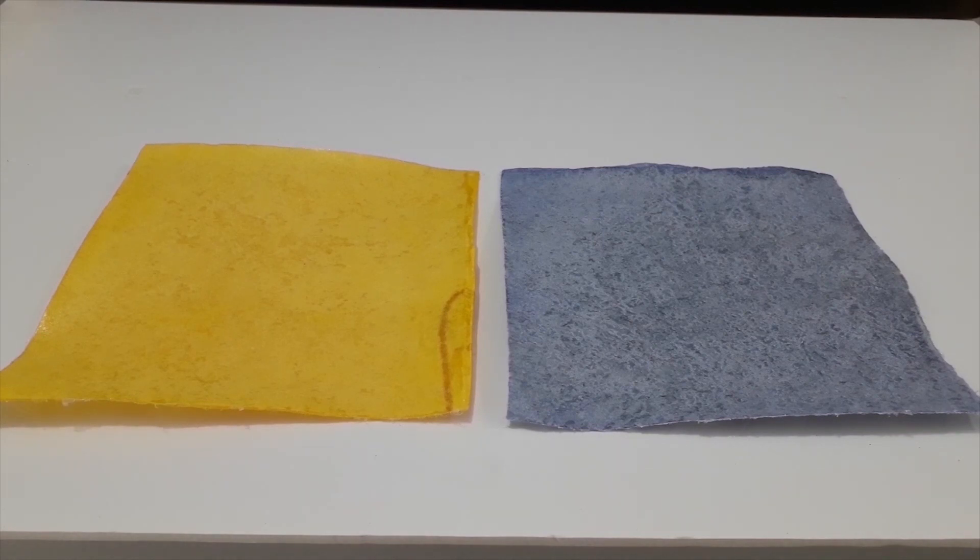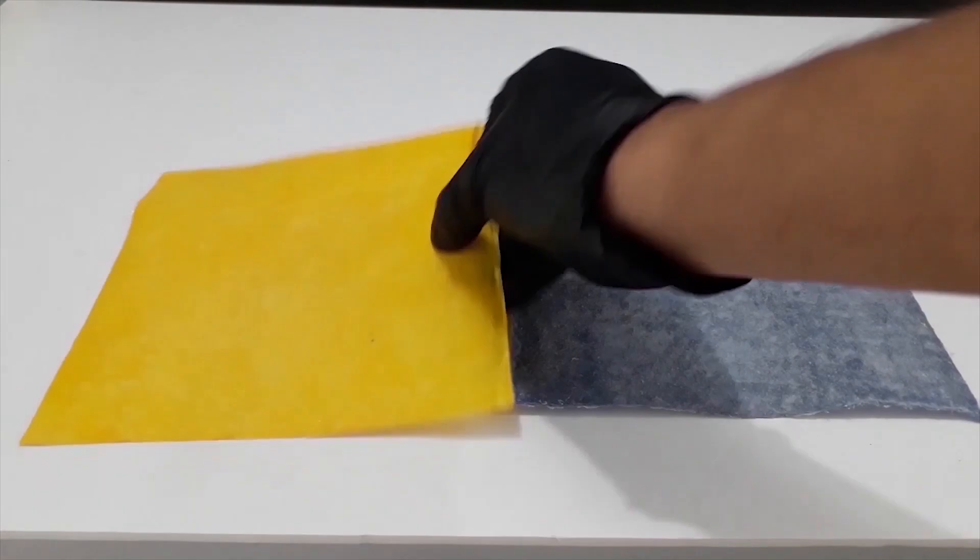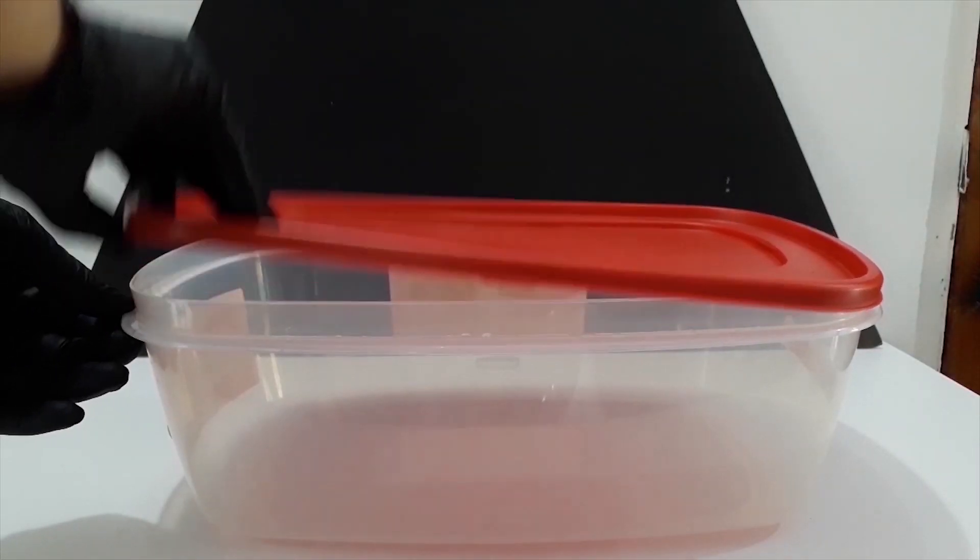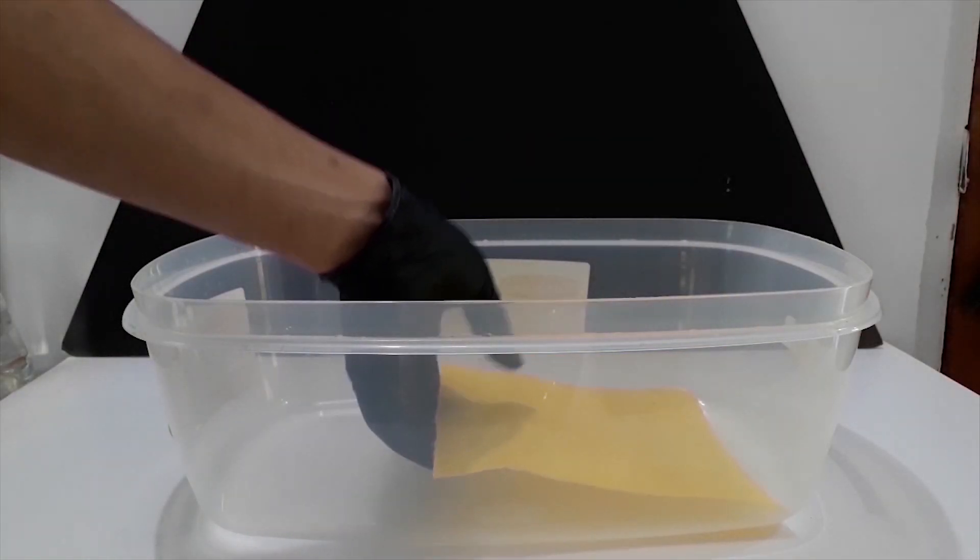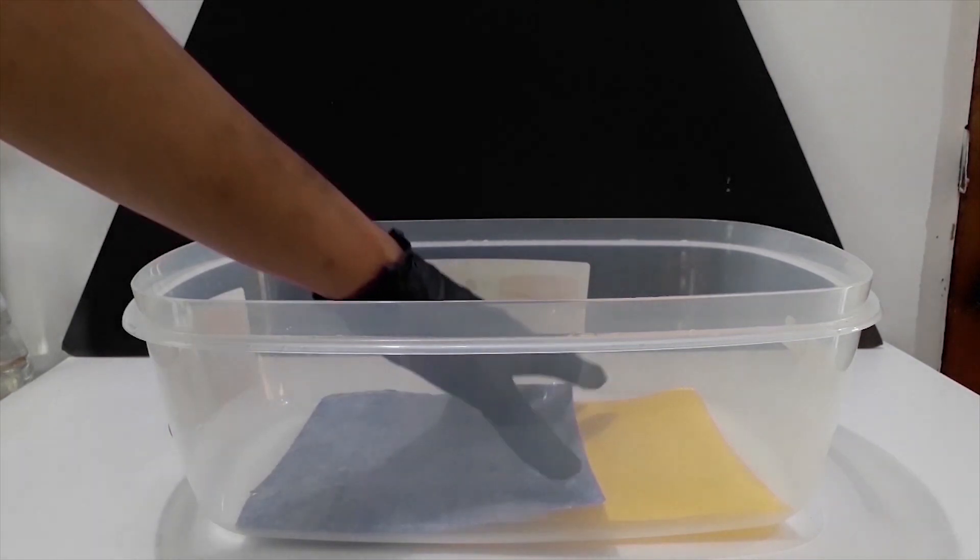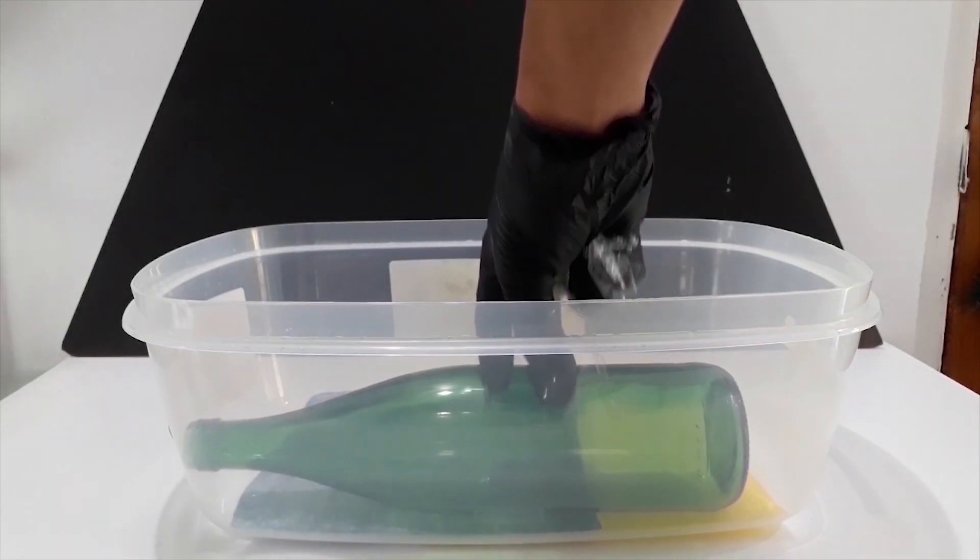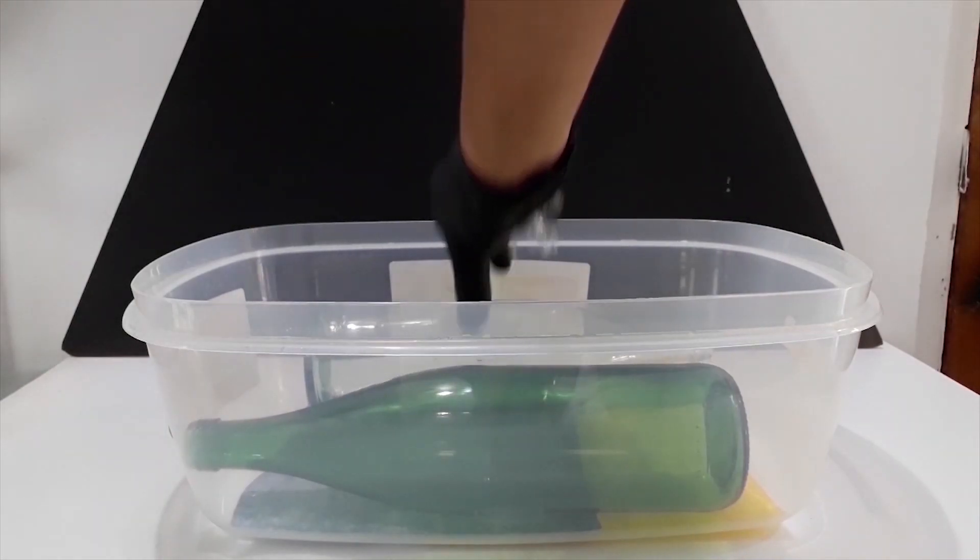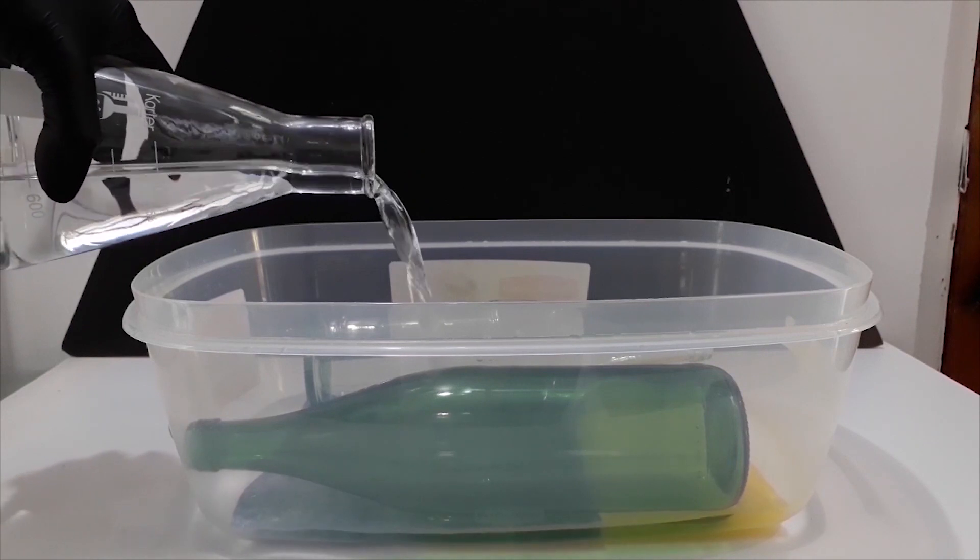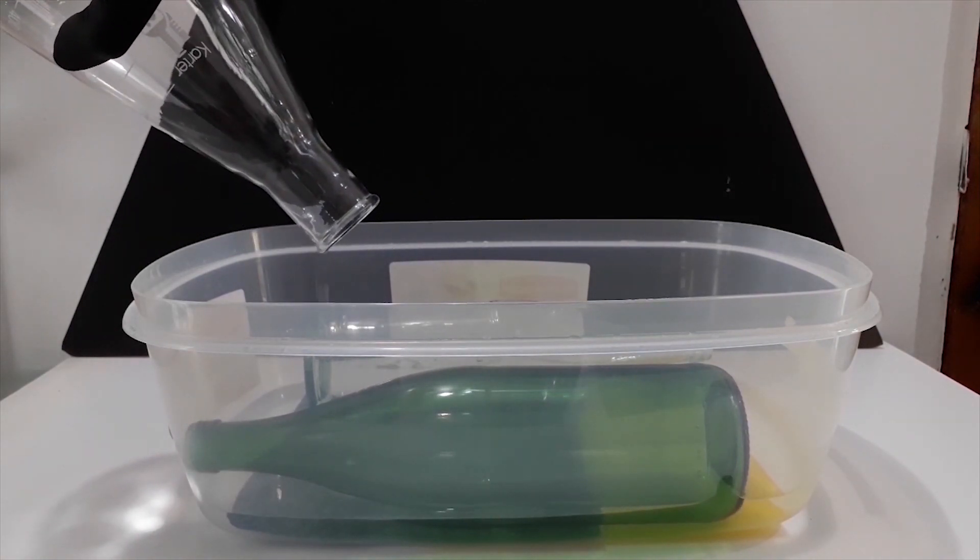This is what the washcloth looks like after curing for one day. I then place the cloth into a large container and weighed it down with 2 glass bottles. This is to prevent the cloth from floating as it is less dense than water. Once it's weighed down, I added all the dechlorinating solution to the container and tilted it to remove any air bubbles from under the cloth.